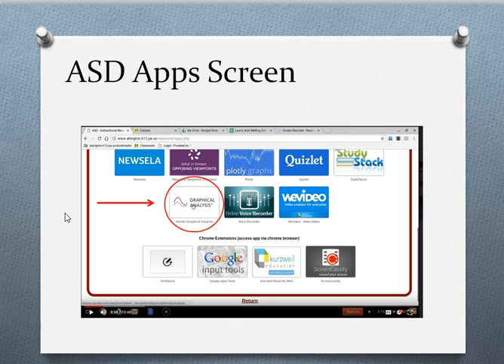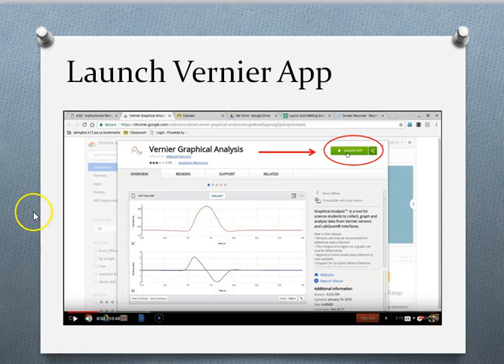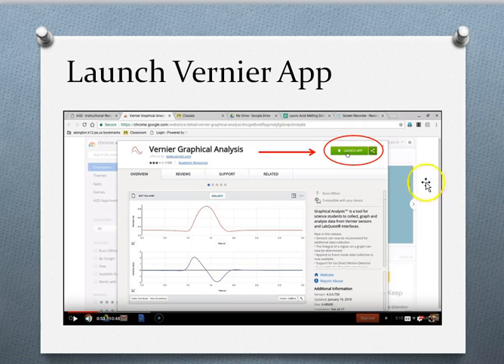Now, once you've done it once — and most of you will have done this with me in Lab — you will add the extension to your Chrome account. When you do that, clicking on this Graphical Analysis icon will take you to the app launch page. The Vernier launch page looks like this, and you're going to go up to this little spot where it says Launch App. I have an arrow pointing to it, and you'll click on that to actually launch the app.